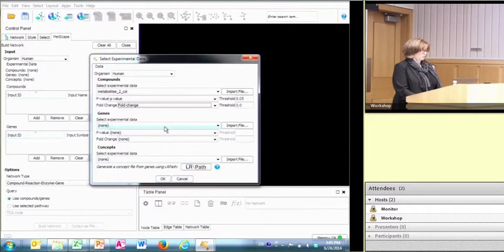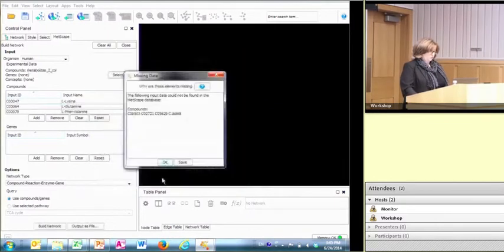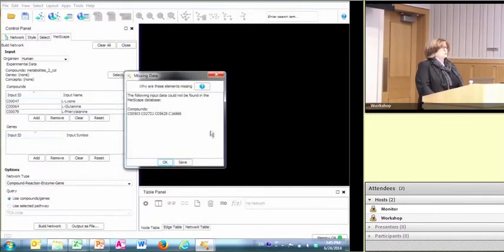Okay, that's where you would enter gene data, which I will be talking about tomorrow, and Bill will show you. Tomorrow I will also talk about that part, concepts in great detail. But for now, we're just going to say, okay, this is a very important screen.